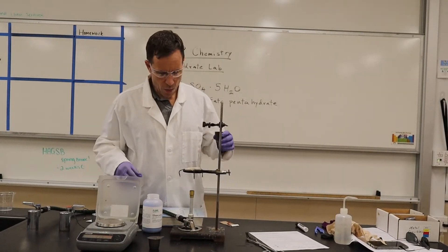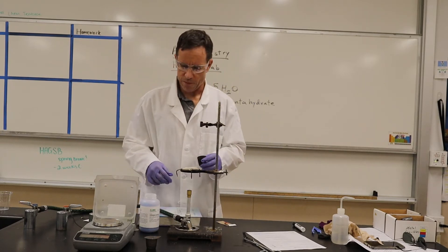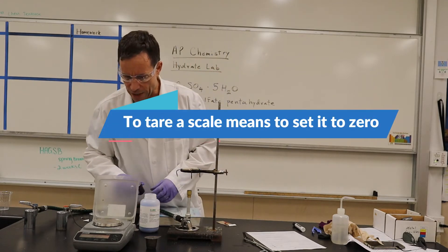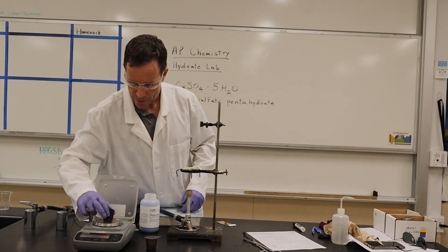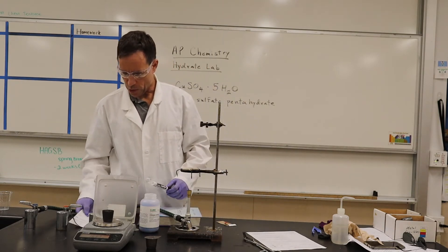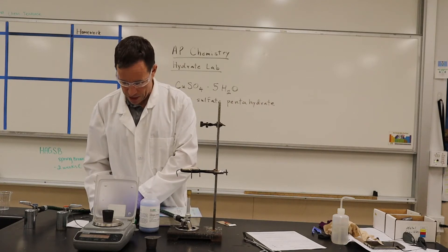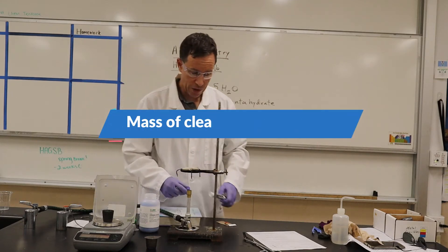What we're going to do is we're going to weigh our crucible — the mass of the clean, dry crucible. I'm going to tare my scale and then put it on there. The mass of the clean, dry crucible comes out to 16.96 grams.